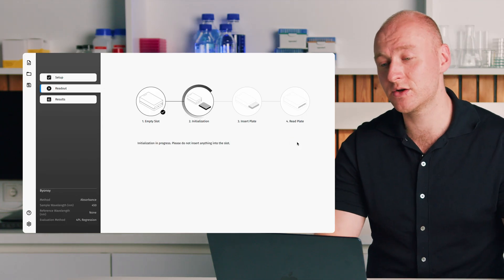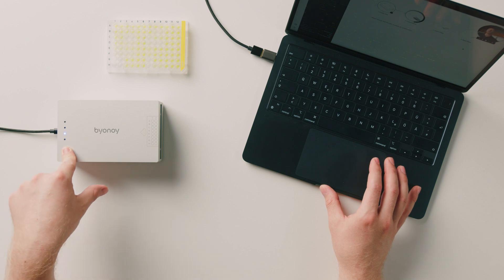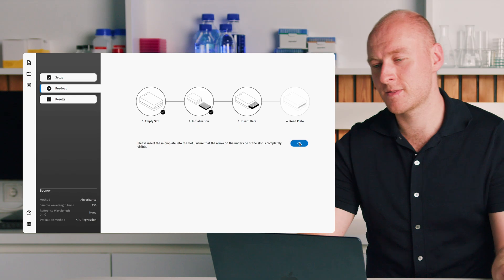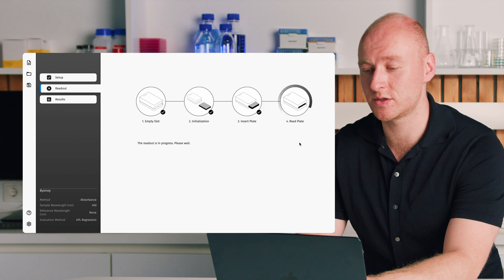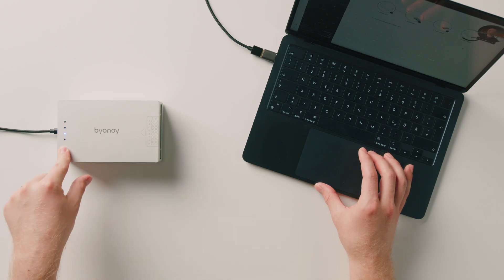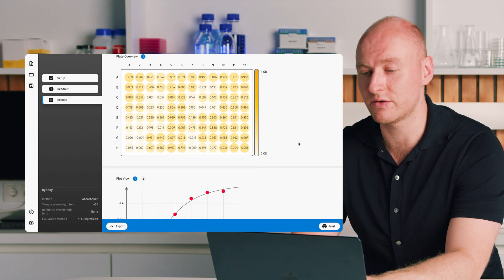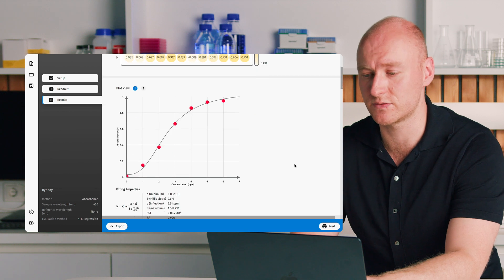We press OK in the software and the initialization is accompanied by lighting of the respective LED. We're then prompted to insert the microplate and press OK to start the measurement. The LED lights up and we already have our results. Because we don't need to scan back and forth across the microplate, we can read very rapidly — everything is read in parallel, down to around three seconds for a 96-well plate.